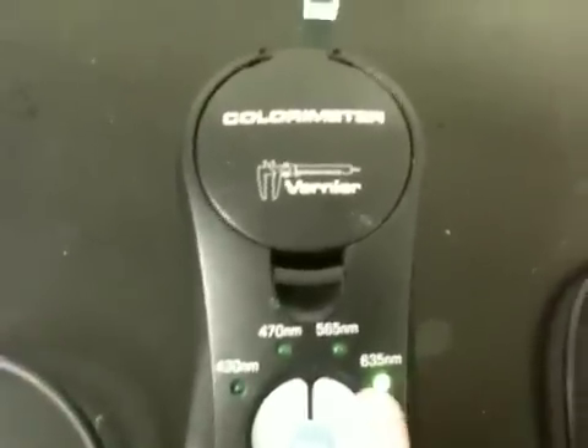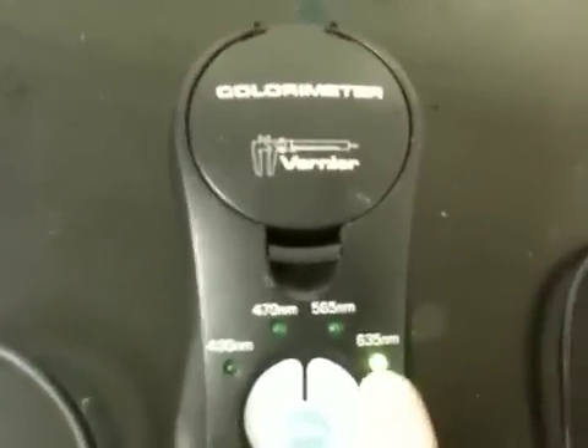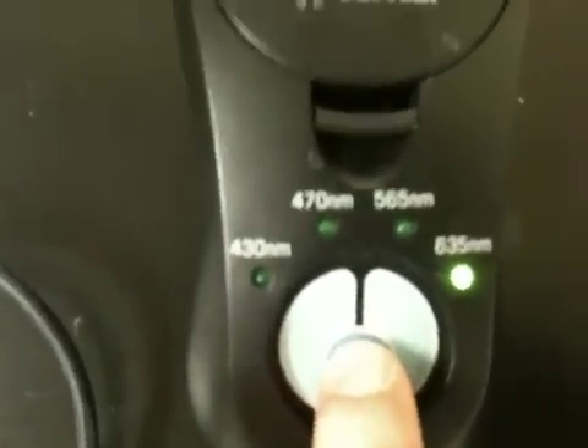So you really want to make sure that it says zero. There are a couple things I have to think about — I'm measuring blue. My solution is blue, so I need to be shining red light. Red has a larger wavelength than blue, so we want to select the highest wavelength that's already selected. There's a calibration button — I'm going to hit the Cal button, and then you'll see the device blink. It's blinking, calibrating.